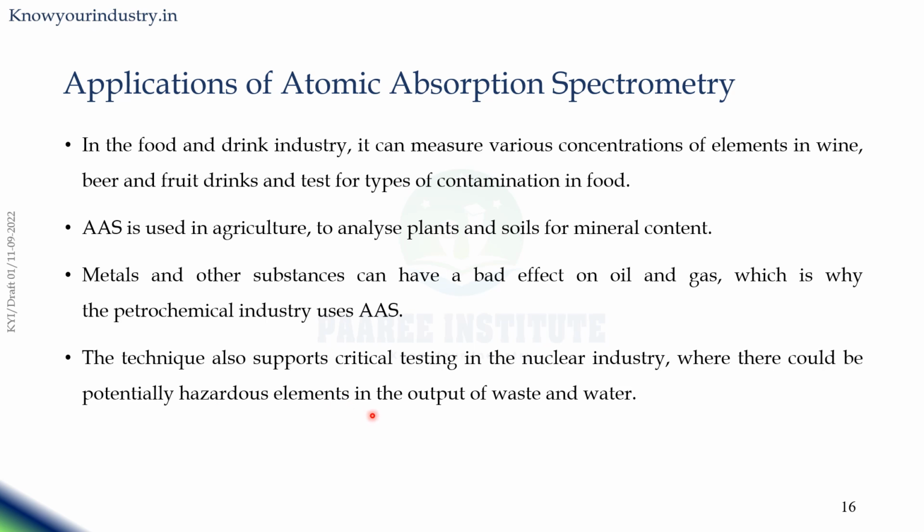AAS is also used in the nuclear industry, where the waste and water delivered from the nuclear industry will be tested for potentially hazardous elements, so that they can manage the waste and water by measuring the elemental impurities present in the particular waste and waters.